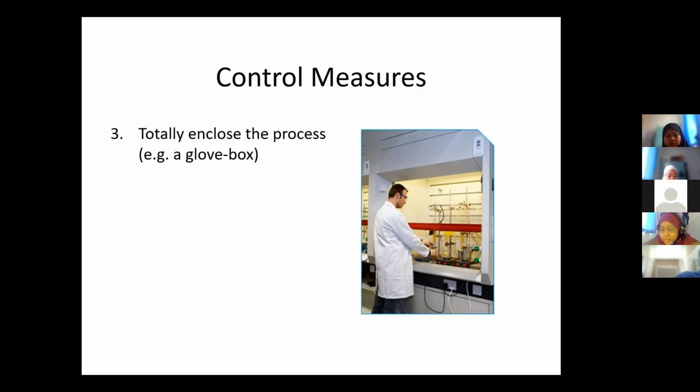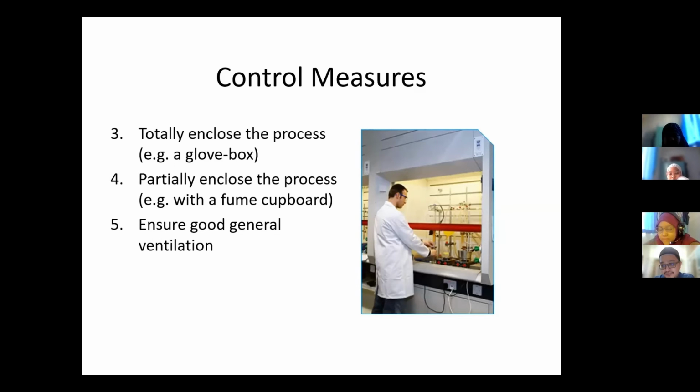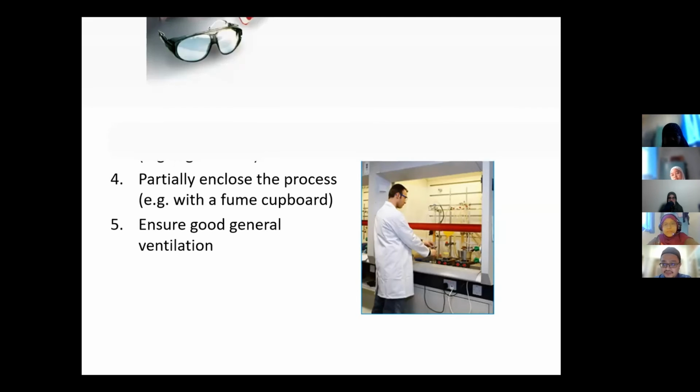Using glove box, okay, using fume hood or fume cupboard, okay, these are all control measures that we implement in the lab. Kalau terbakar ke apa dalam tu, all the asap, the vapors may be hazardous. So we have ventilation that will take it away from us. So we are not exposing the whole body. Only the needed part only is being put in the cupboard.